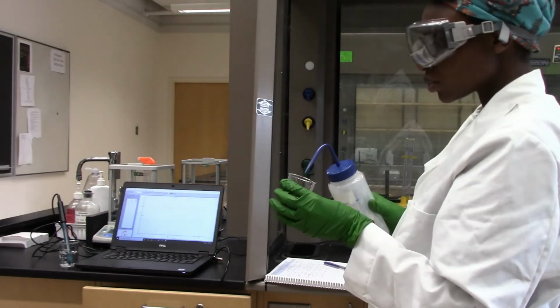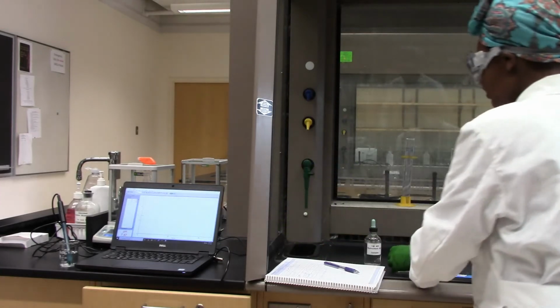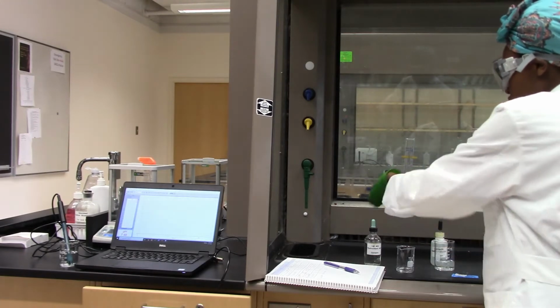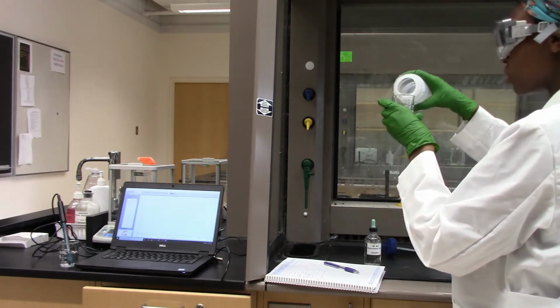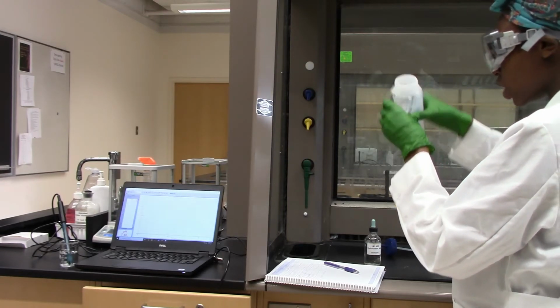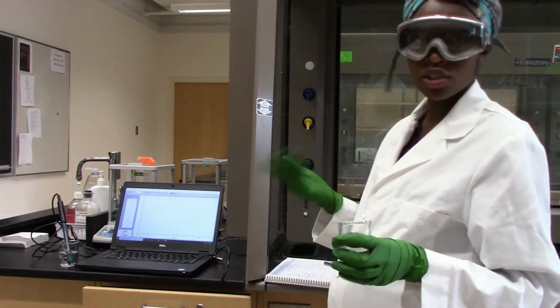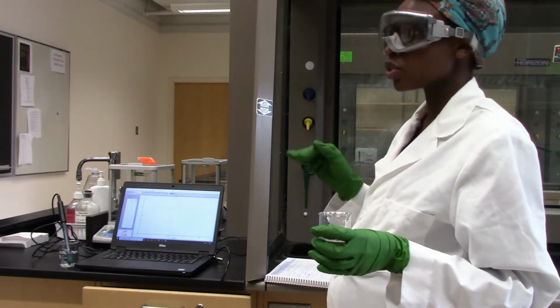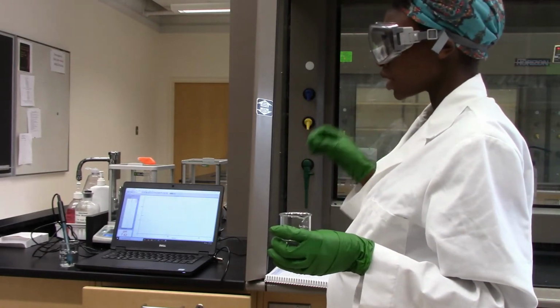Okay, just to establish a stable pH reading, I'm not just going to take one pH measurement, but I will also get a pH reading for another 50 milliliters of water and see how different the two pHs will be. If I obtain a pH reading that's 0.5 units difference or less, then I know that my pH is stable.